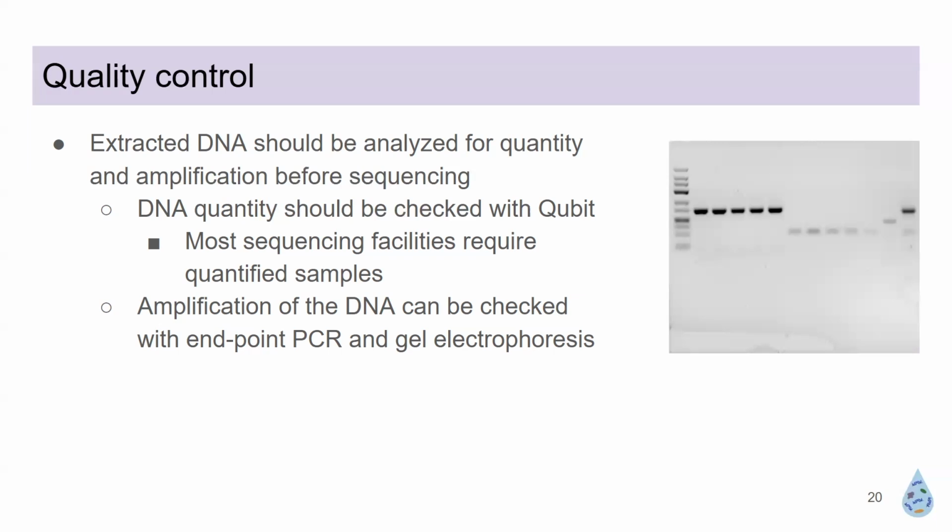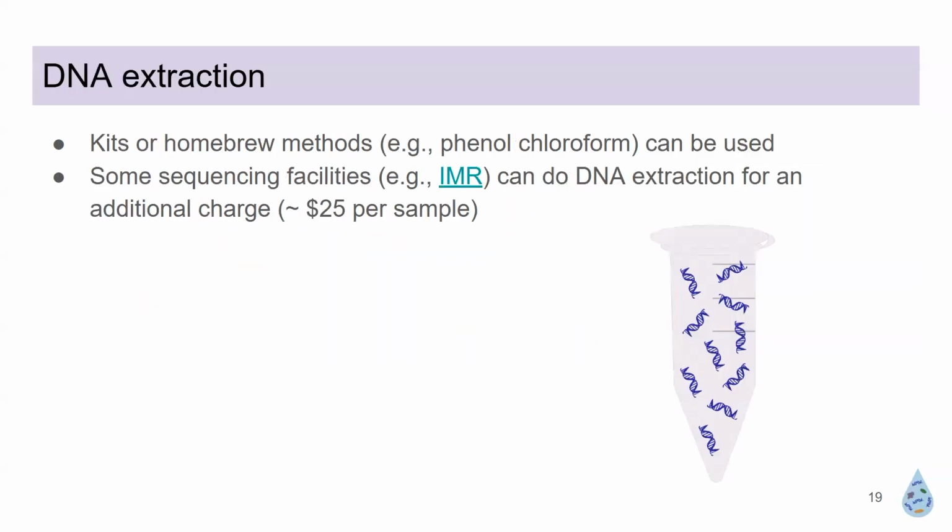It depends on the amount of salts that are in your sample, the amount of humics, the amount of carbon, the biomass that you're targeting, the pH of your system. So having a good understanding, the characterization of your system is very important to start with, and talk to folks, scour the literature, give me a call. We're always glad to talk about these kinds of things, but it's not ever one size fits all.